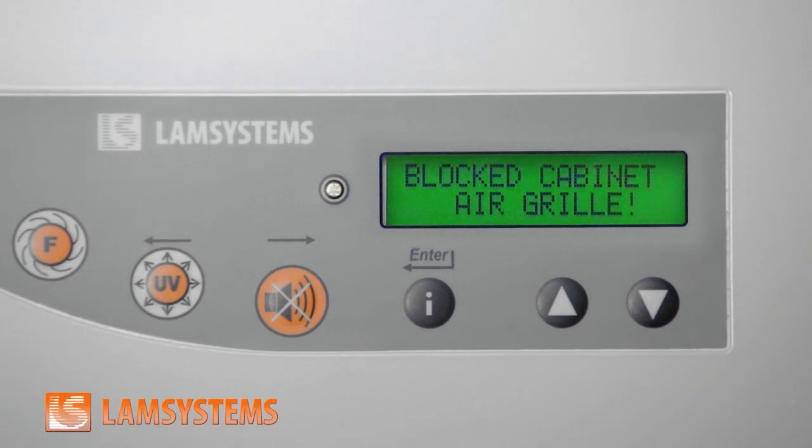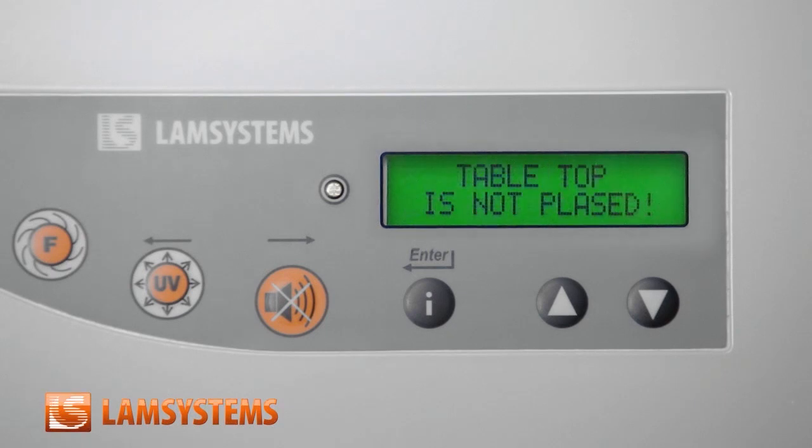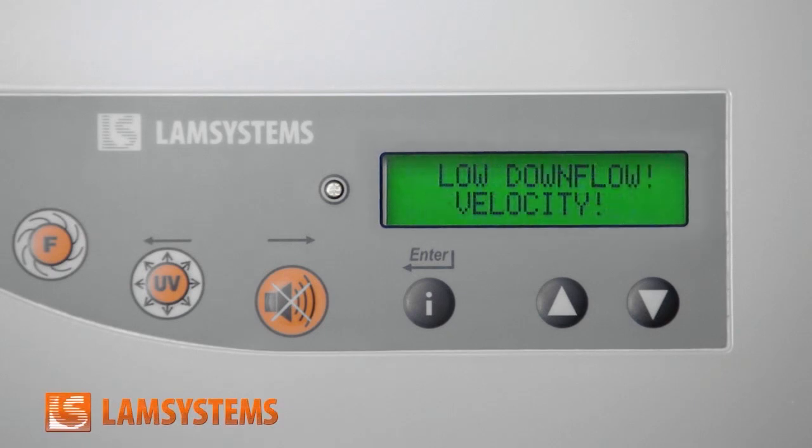The operator doesn't have to find out what has happened. The system itself identifies the problem and sends the message to the display indicating the fault to be corrected. What the operator has to do is to follow the instructions.